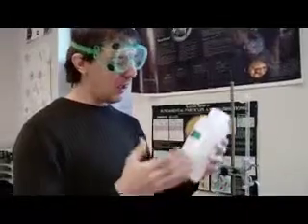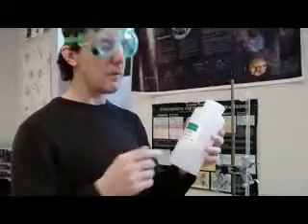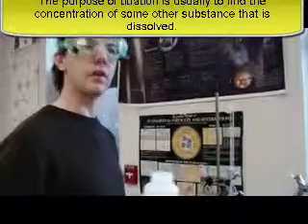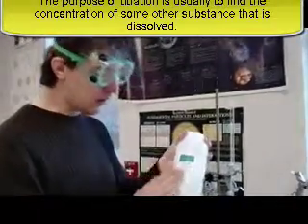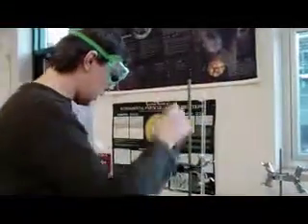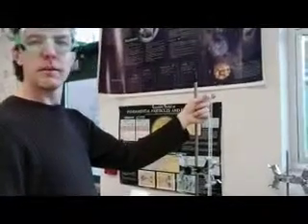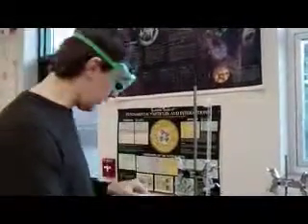Now, when you do your lab, you're not going to know what the concentration of your base is. You are actually going to have to determine the concentration by doing a titration. Okay, so you'll undergo the same process to standardize your base. So the base is going to go in our burette. Now, there's a few ways to get that in there. The easiest way is to either get a funnel or use a burette with a little flared top and just pour it in there. And we'll do that here in just a minute.